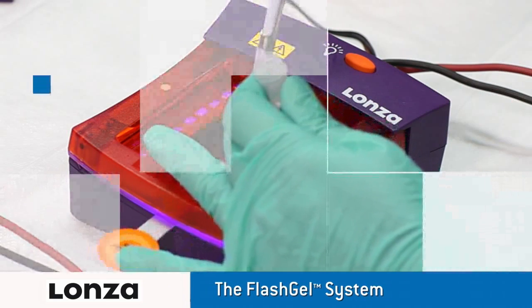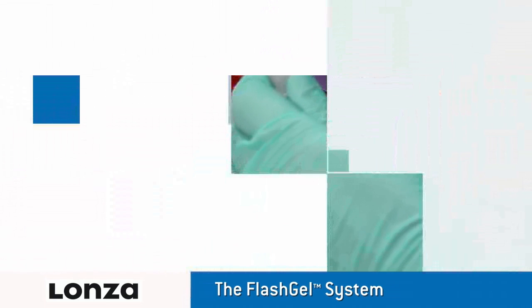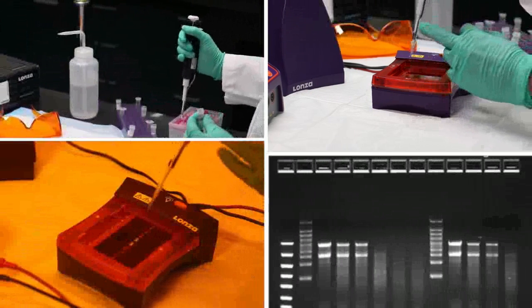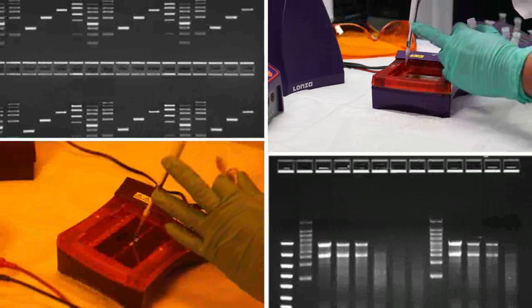The FlashGel system provides complete separation, recovery, and documentation safely in minutes. Simply load your DNA or RNA samples and watch bands migrate.